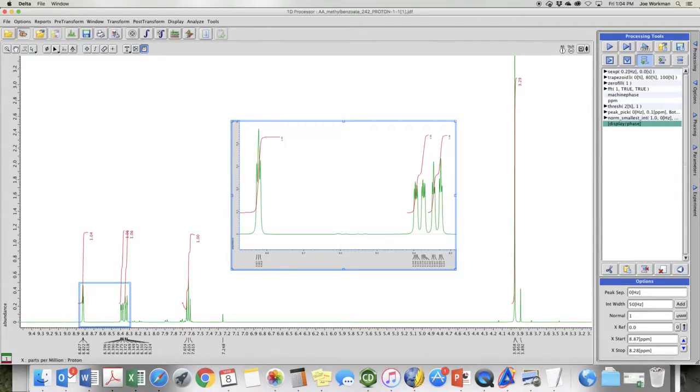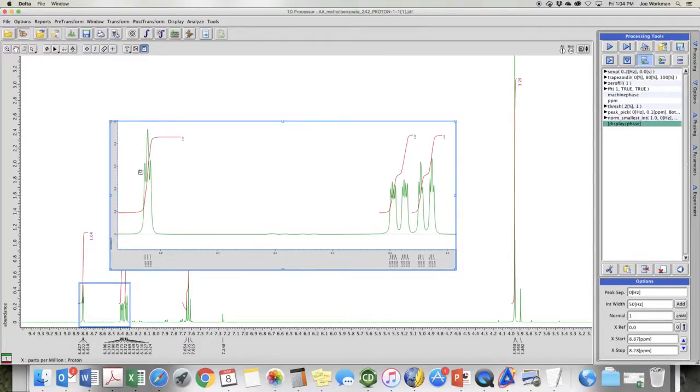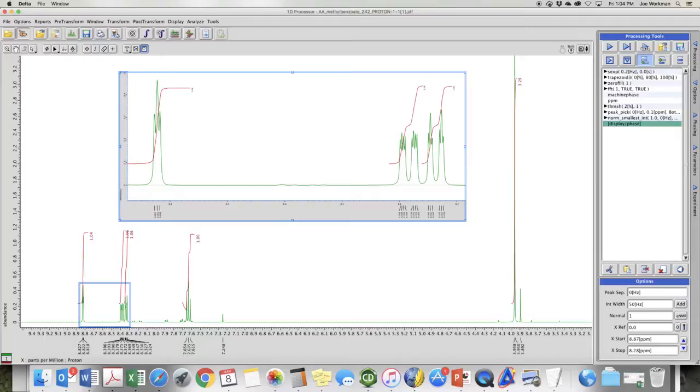And then as I go to this square here, I get these double-headed arrows. There are my double-headed arrows, and so I can make this wider. If I press the Command key, I can move the picture-in-picture.